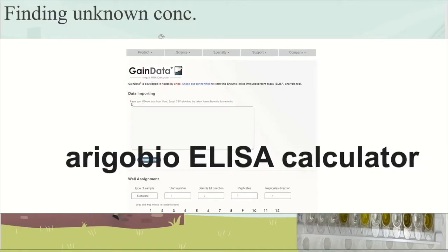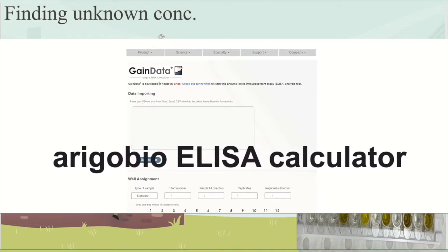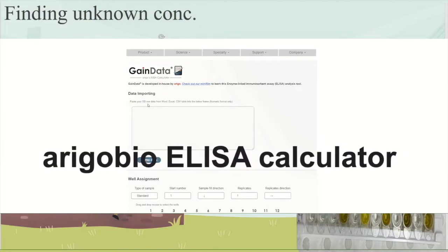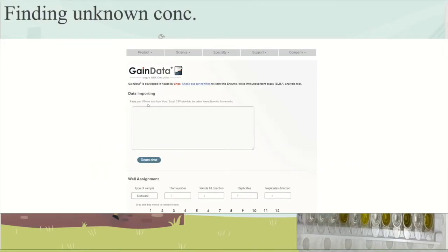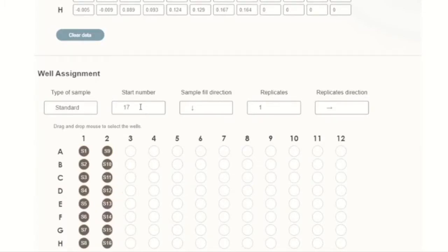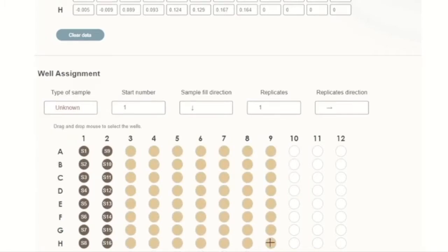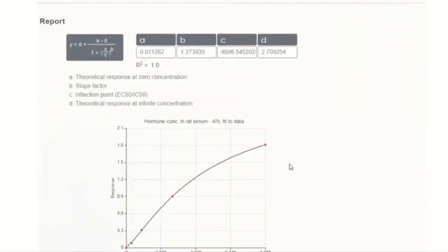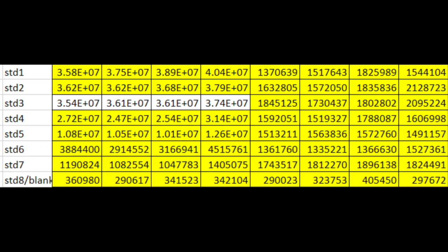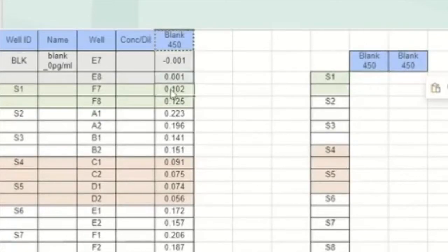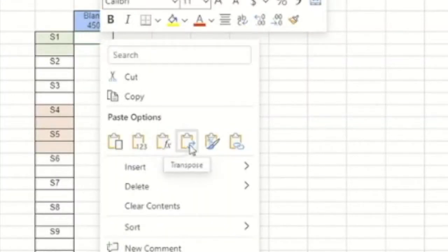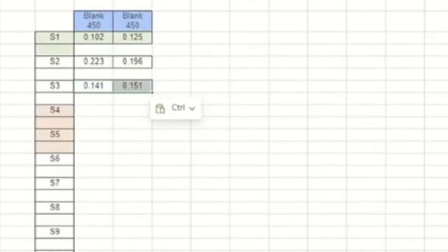There is an online tool called Arigo where you can enter your concentrations and it will tell you your unknown concentrations without needing to download any four-parameter logistic software. You simply enter your standard curve concentrations and your unknown concentrations. The data needs to be side by side — I copied the values and used paste-transpose to arrange them side by side rather than stacked, and that's the correct format for placing data into Arigo's ELISA calculator software.